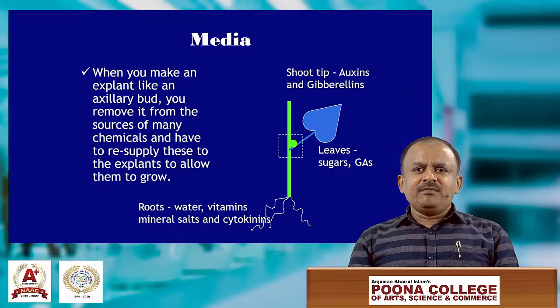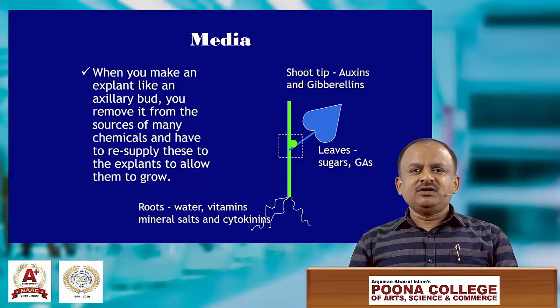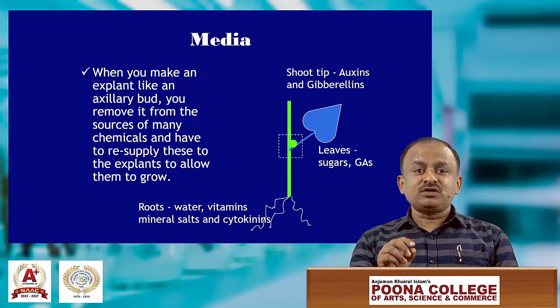Now here, media composition is very important. When you make an explant like an axillary bud, you have to remove it from the sources of many chemicals and have to resupply these to the explant to allow it to grow.